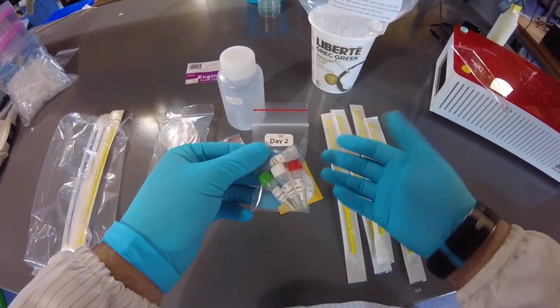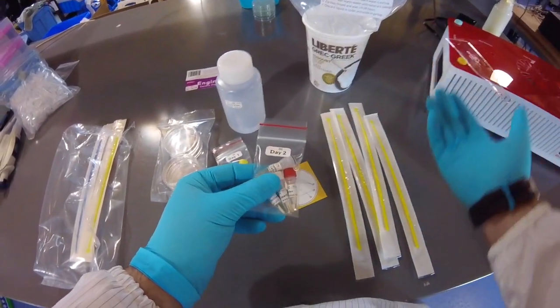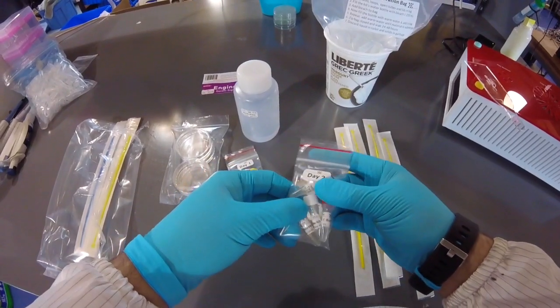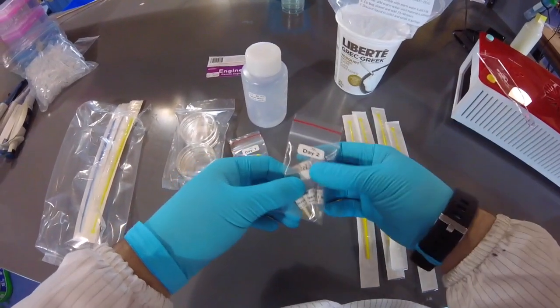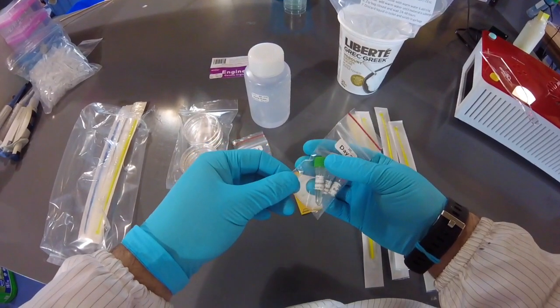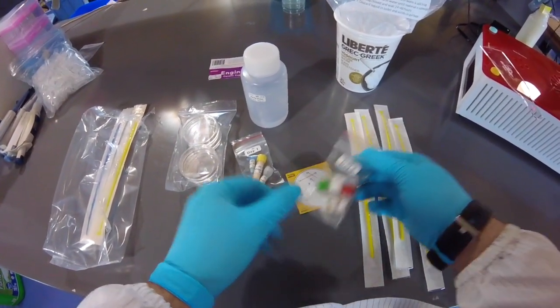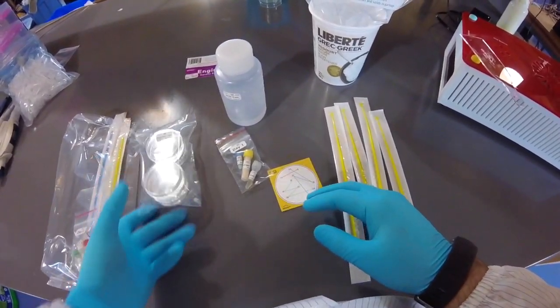We're going to be using it tomorrow on day 2. In general, it comes with some positive control cells, meaning cells that are already engineered, so you can compare them to your cells that you're trying to engineer. We have a buffer called T-buffer. This is used to help put DNA into the bacteria, right? The process of genetic engineering. We've got some DNA, and we have some recovery media here, which is used to help bring the cells back, get them growing again after you do the engineering, okay? So we're not going to use this. This is obviously for day 2, but the rest of this stuff is for today.